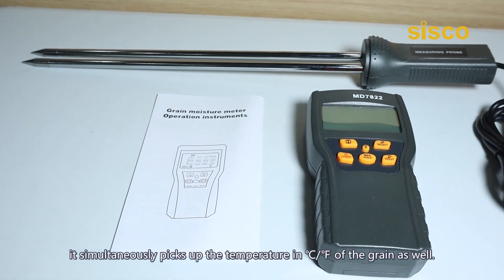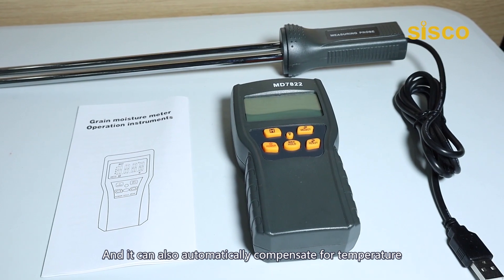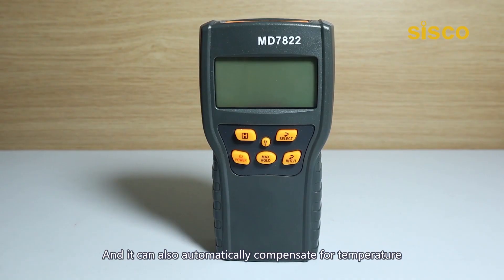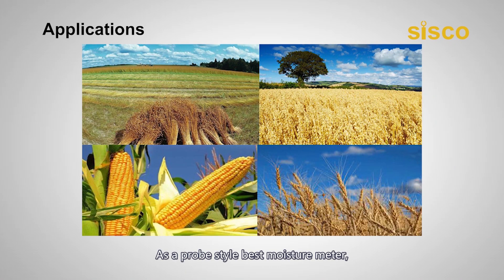While measuring the moisture content, it simultaneously picks up the temperature in centigrade or Fahrenheit of the grain as well, and it can also automatically compensate for temperature so that you don't have to adjust the readings manually.